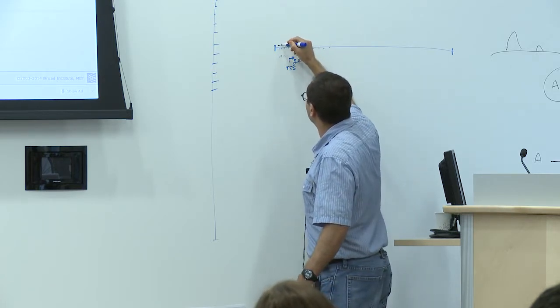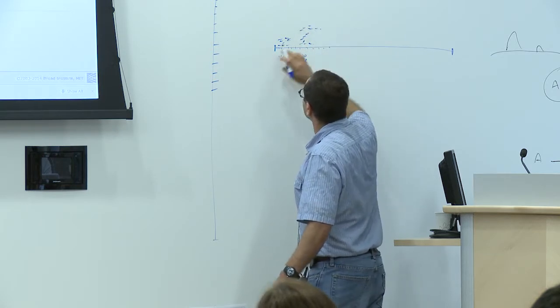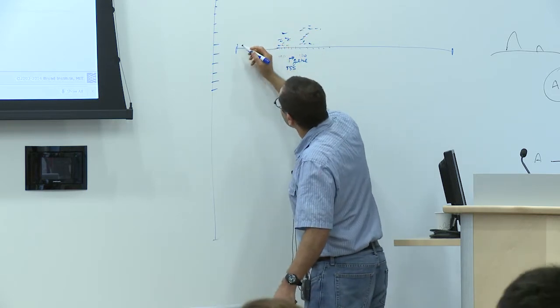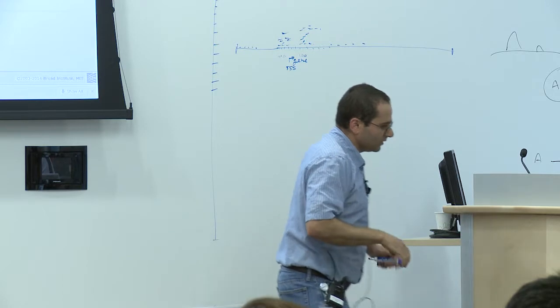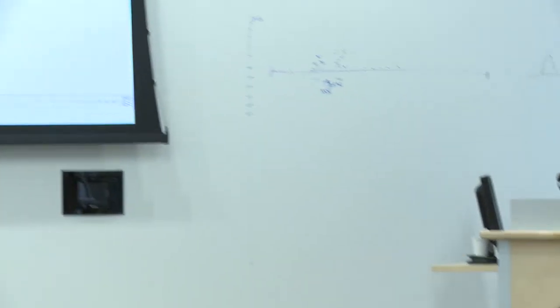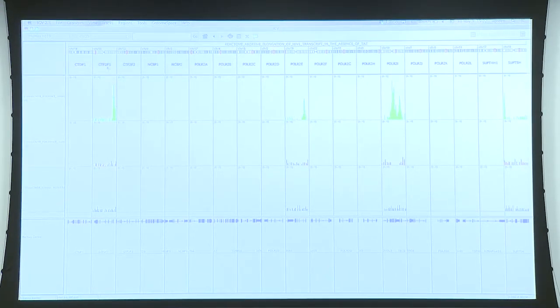And let's say that most of the signal is going to be here. Let's say that I don't want to start at the beginning of the chromosome. And here we don't have a lot of signal. I think you've seen it pretty nicely when we were doing it in the IGV. Okay, so here, for instance, is a gene, and this gene goes to the left direction. You see that most of the reads are falling here.